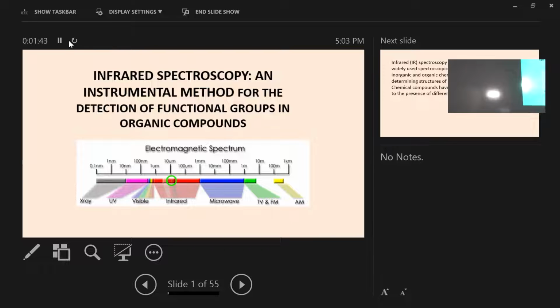When you change the diffraction angle, that means the source angle, it will change the wavelength of the light, and the molecule will absorb. So depending on the change in wavelength, where we can find the maximum absorbance, that is the lambda max.